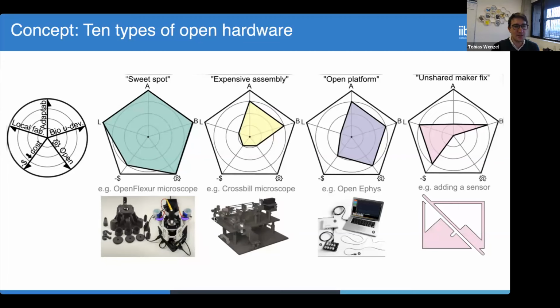And it's good that people share this, but it has very, very poor rankings in all of these technology access categories. So it's nice that now with these instructions, people who have less know-how, who might not know from scratch how to design a custom microscope, can assemble a new kind of high-performance microscope that they couldn't just get off the shelf. But it's not necessarily cheaper.